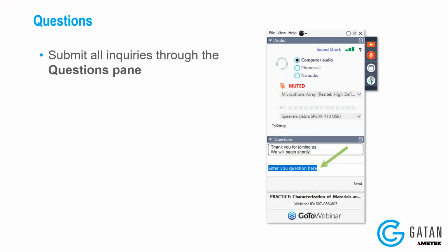When you have the microscope in diffraction mode, it's really hard to measure how many electrons are hitting the detector. But in imaging mode, it's very easy to count every electron one by one and determine how many electrons I'm going to be putting into my pattern.